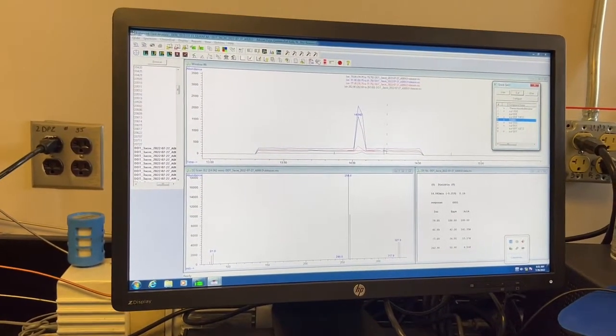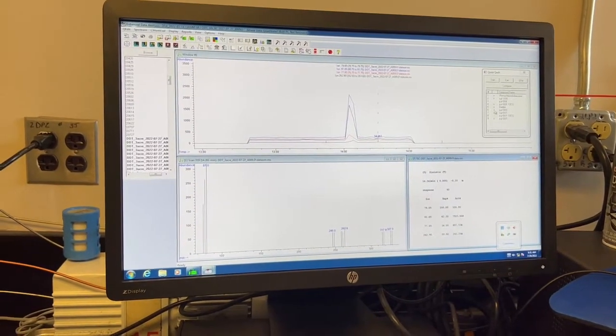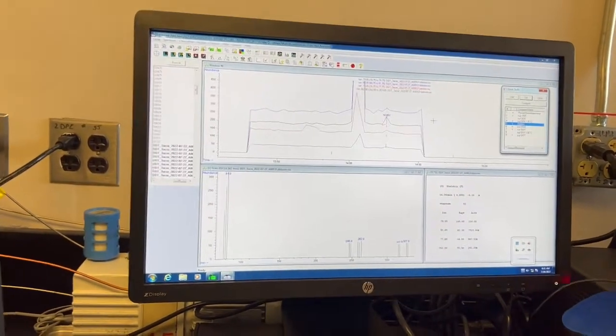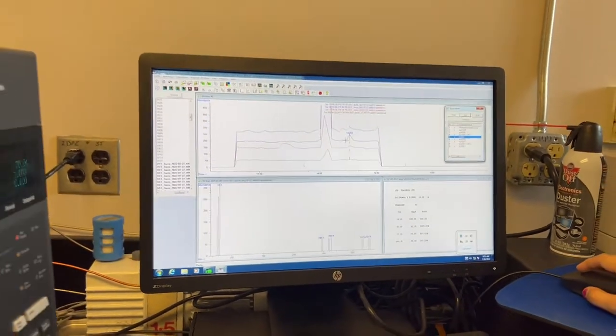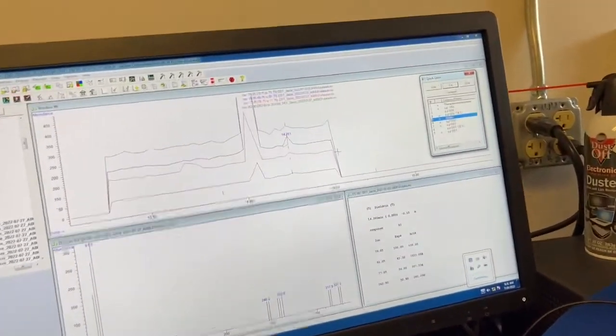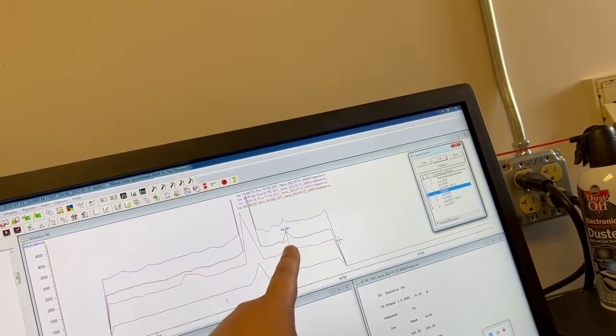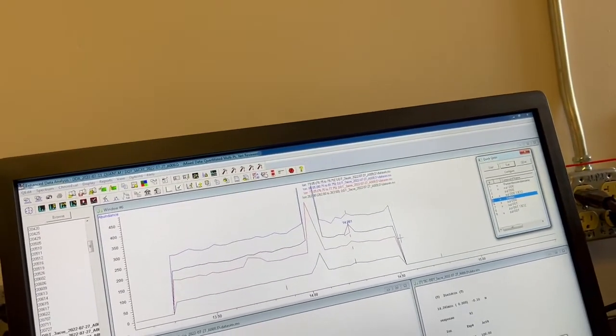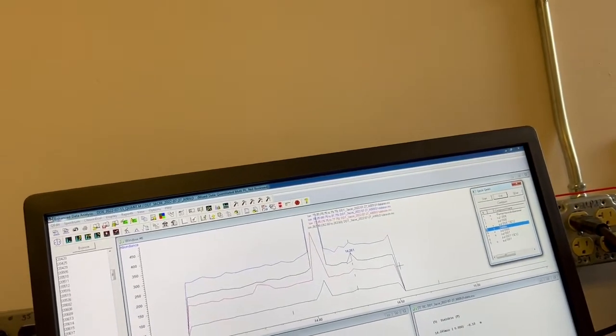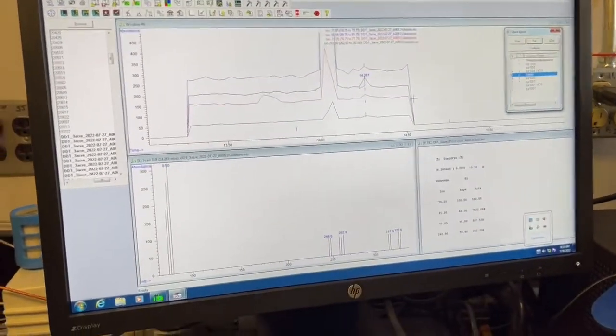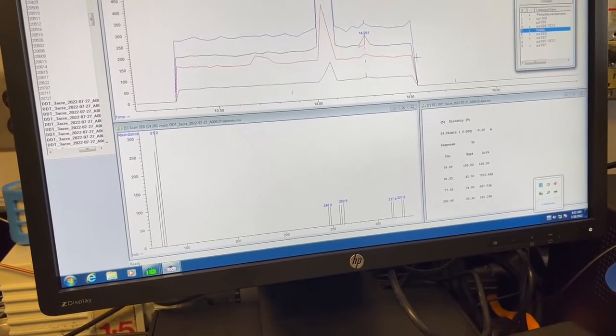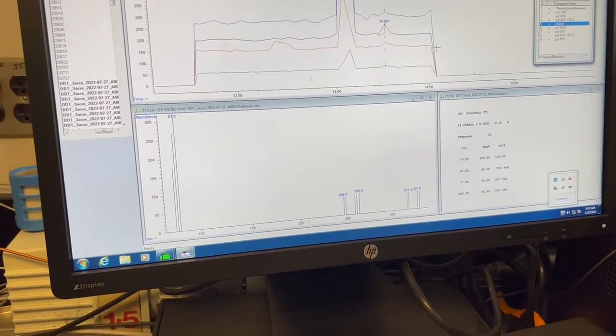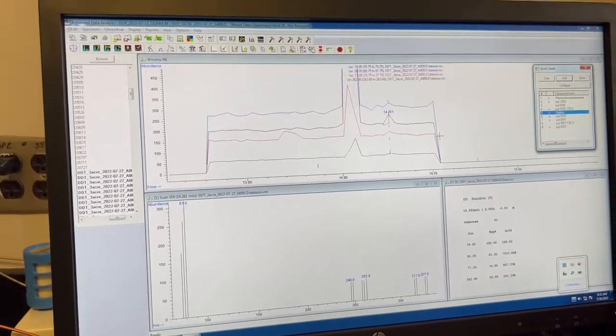So what I usually do is just draw an arbitrary line under it. And then if I click on it again, it'll give me a better zoom. You can see the machine automatically makes the integration as this veiled shape. So this is for the signal that has many peaks. Then the computer will do the integration as very veiled shape. So we need to check it that way.